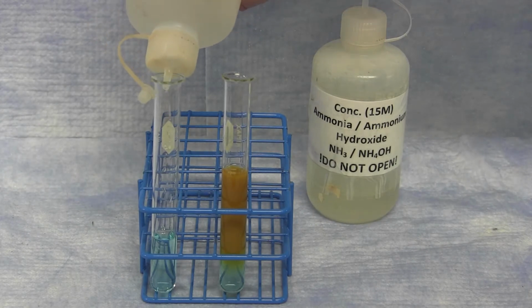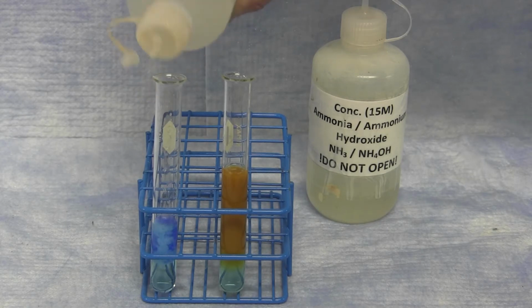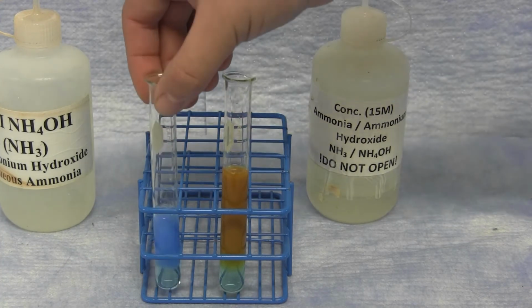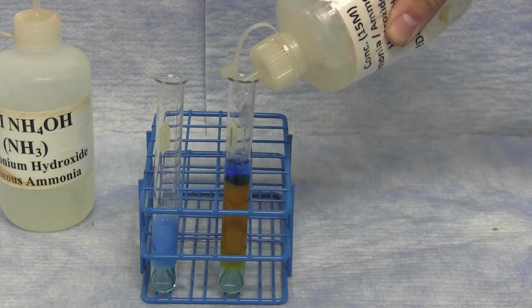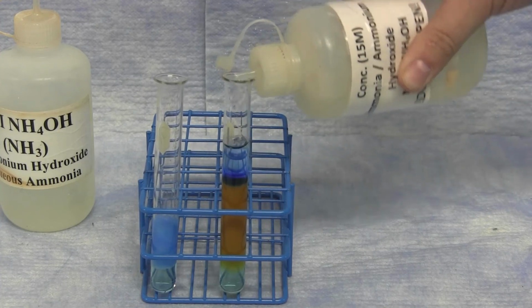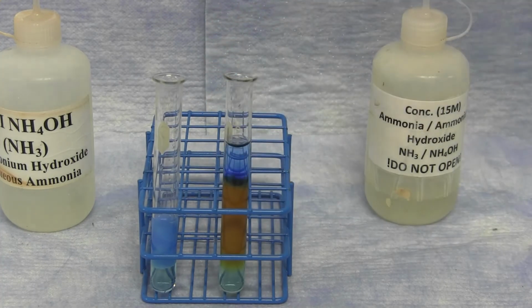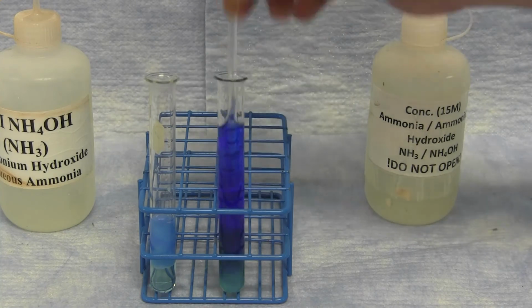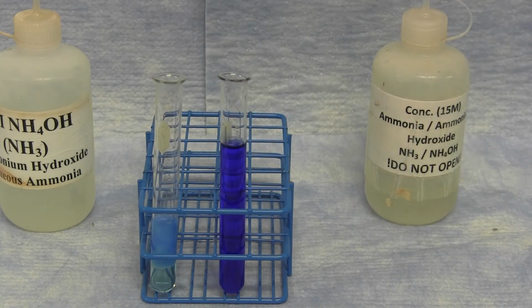You'll see a number of different chemical reactions that happen as you continue to mix things together. Some things will cause color changes, others will cause precipitates to form, some may form gas formation, and these sorts of things. So you're looking what happens when you mix things together and what are the visual observations that you can tell that a chemical reaction has occurred.